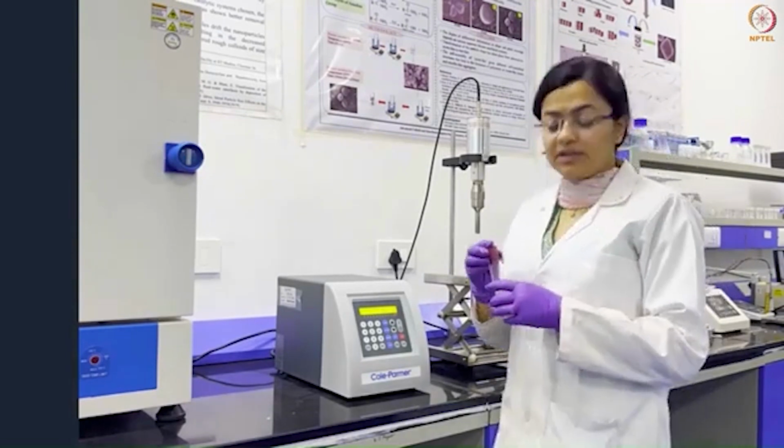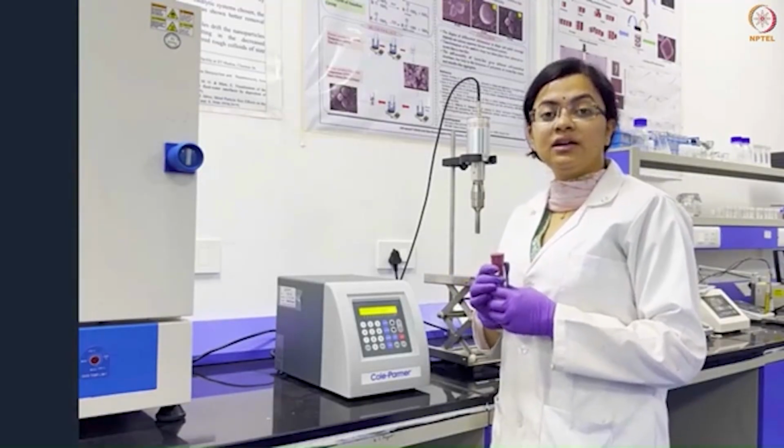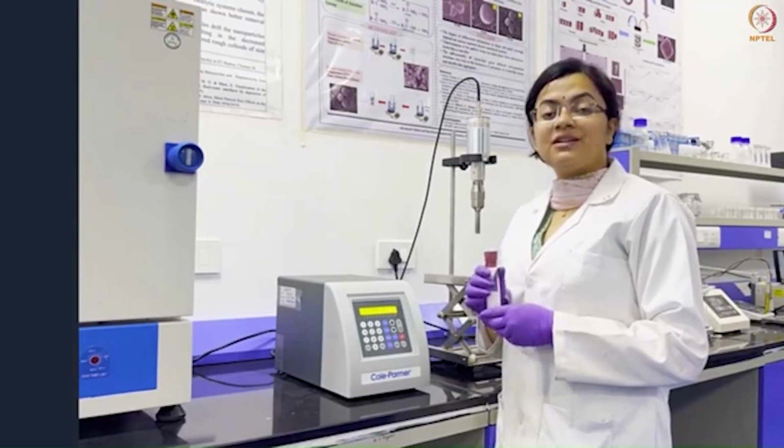After this process has been completed, we can put a liquid sample under the microscope and analyze the result, as the product can be seen as an emulsion.